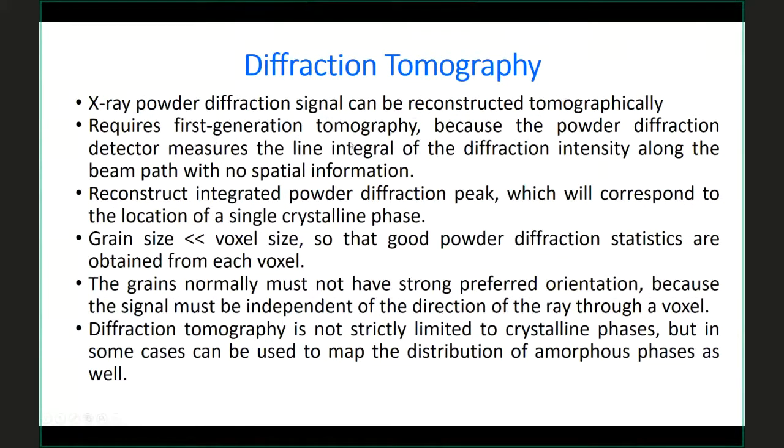As I said, it requires first generation tomography. And so we're going to select a single peak in the powder pattern and reconstruct it. It does require that the grain size be less than the voxel size, so that at each voxel, you're actually getting good powder diffraction statistics. And your grains should preferably not have a strong preferred orientation.